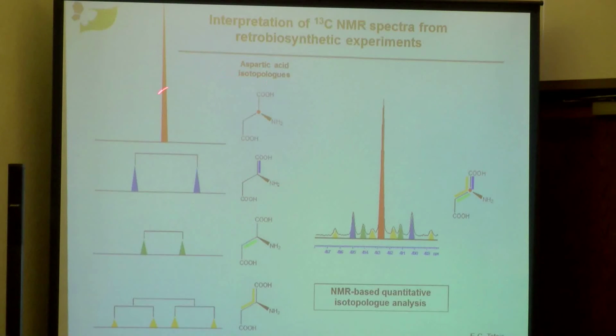So this is an example of how to interpret the data in an NMR spectrum. Especially the carbon-carbon couplings are very important in this approach.